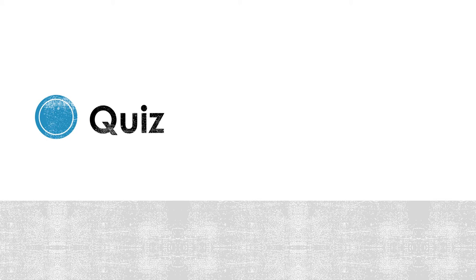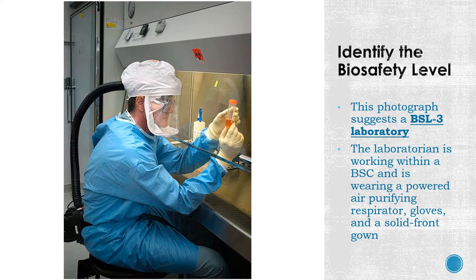Quiz: identify the biosafety level shown in the image, taking note of the presence of the biosafety cabinet and the type of personal protective equipment worn. This photograph suggests a biosafety level 3 laboratory. The laboratorian is working within a biosafety cabinet and is wearing a powered air-purifying respirator, gloves and a solid front gown. Note how the worker is not fully covered by the suit and parts of his neck and ears are exposed — do not let the respirator confuse you into thinking this is a biosafety level 4 laboratory.